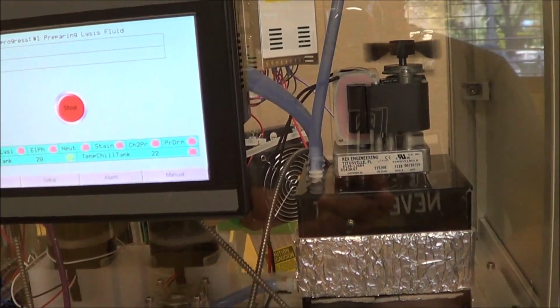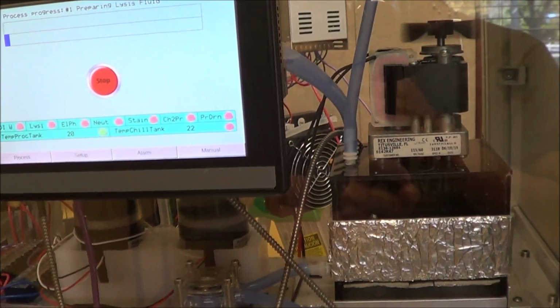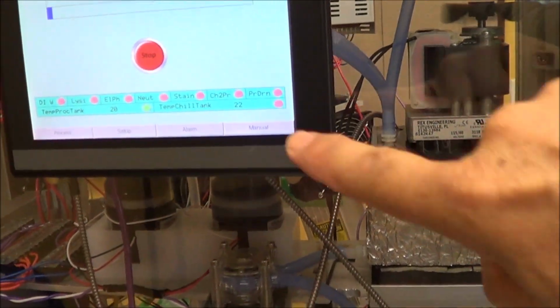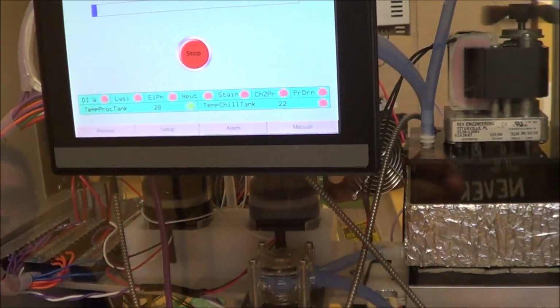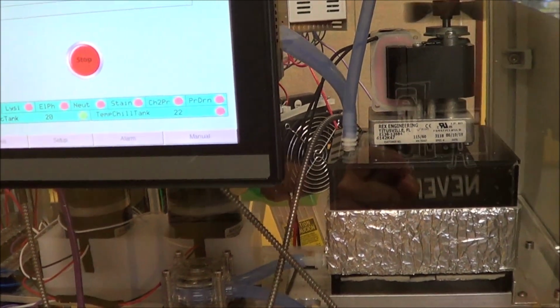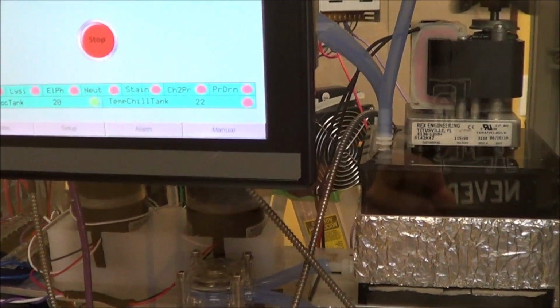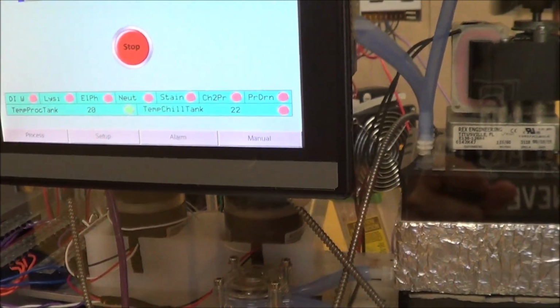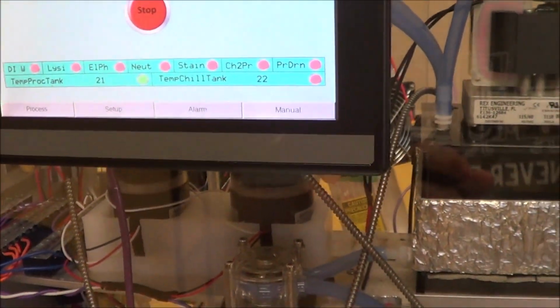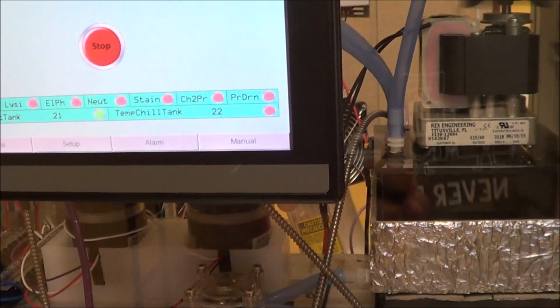Okay, so it's round off. And you've got the code cut off at 22 exactly. Right. So as soon as we hit 22, it will do the proper process. But are we rounding up or rounding down on the screen, 22.6 or 22.4? Do you want me to put the decimal place? No, don't put the decimal place in there. So we're just truncating them. So 22 means we're at least 22. Yeah, I just did truncation on the screen. That's fine, to be honest, just because I couldn't find a round function in here, so instead of building a function, this is fine.